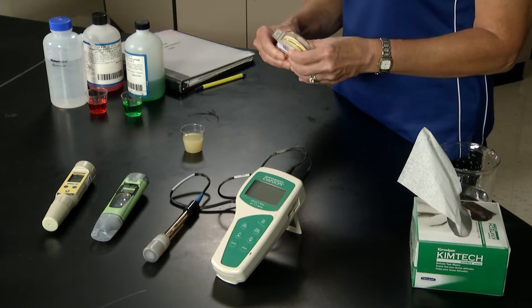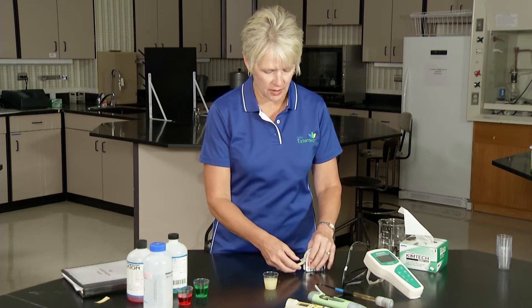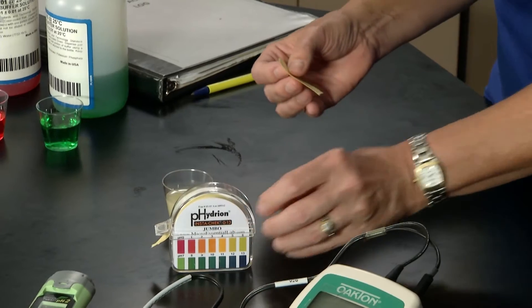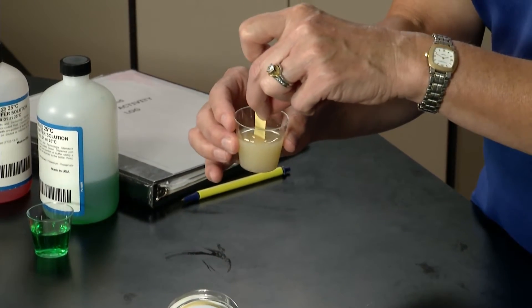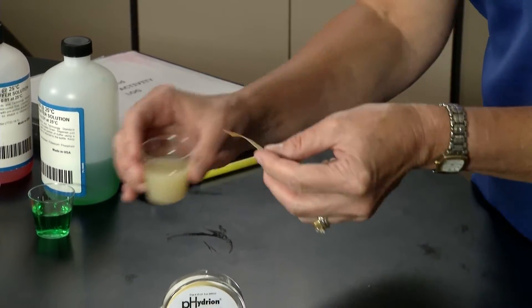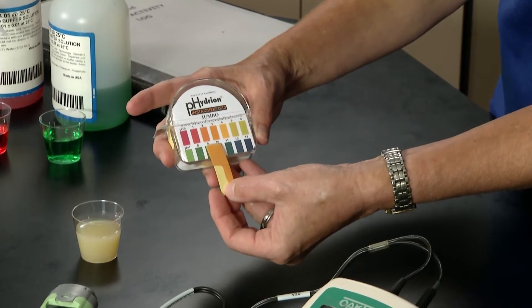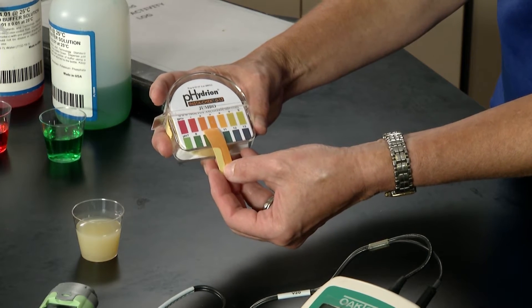The test strips are very convenient and easy to use, but they're not very accurate. They give you kind of an idea of what the pH will be of a food so you can continue to work on your product. With this we simply dip it in and instantly we have our results. We compare them to the color chart, and this is between 2 and 3 on the pH color chart.